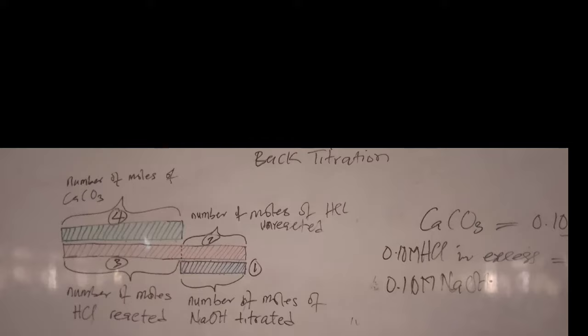4. Determine the number of moles of the unknown from the number of moles of the excess reagent HCl that reacted with the unknown by their mole ratio of combination from the chemical equation. We can proceed to the laboratory for the experiment.